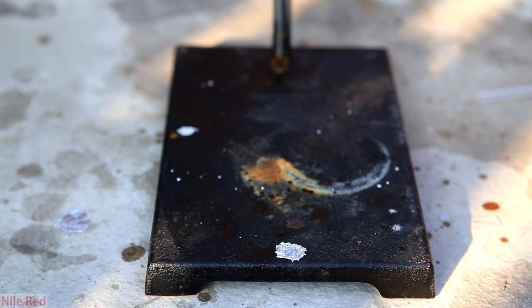The liquefied aluminum shot out of the test tube that I mentioned earlier can actually be found scattered all around the base of the stand.